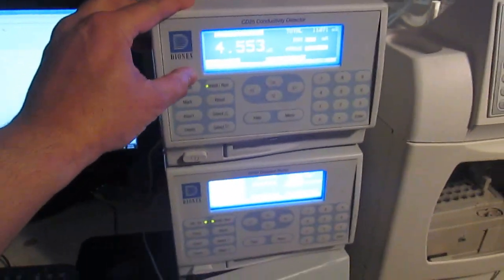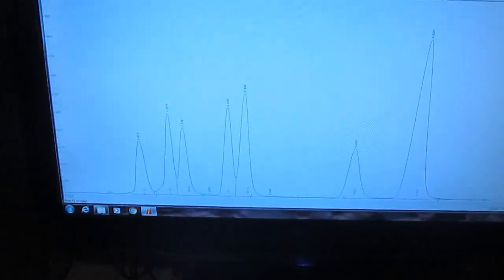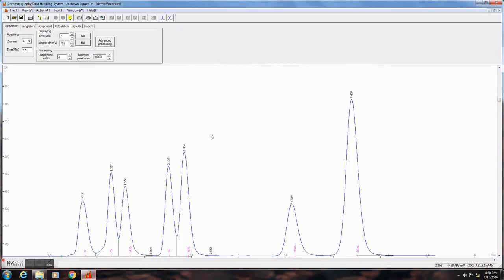This is an older system and I had to dig around eBay to find good deals on used equipment, but I still hope to get decent chromatograms like this one here.